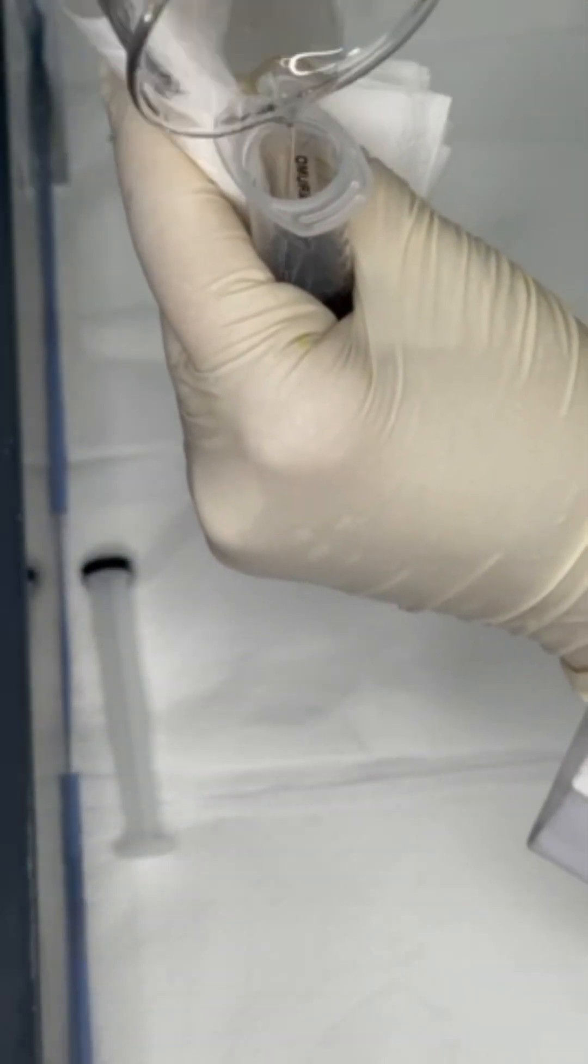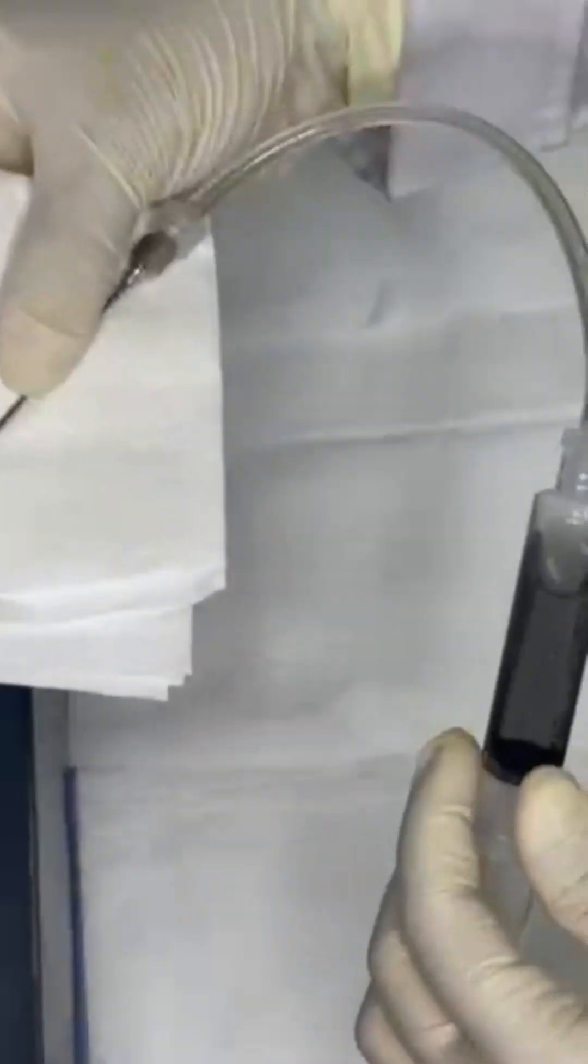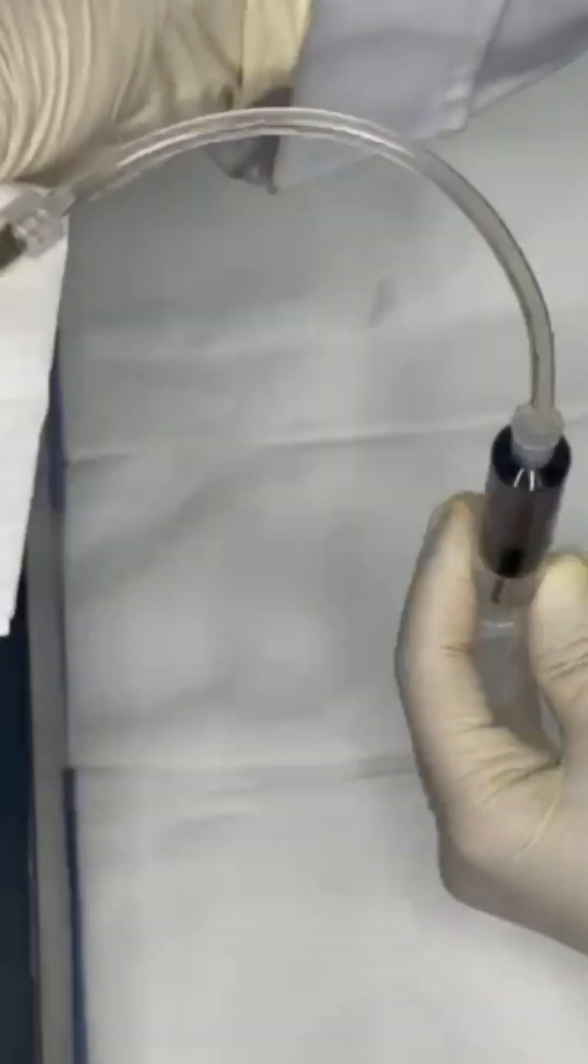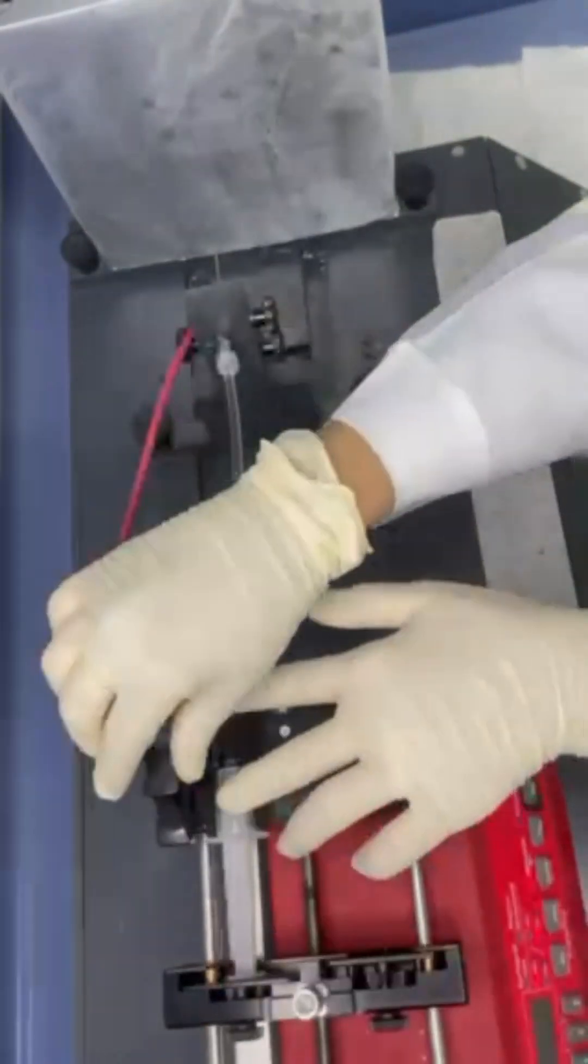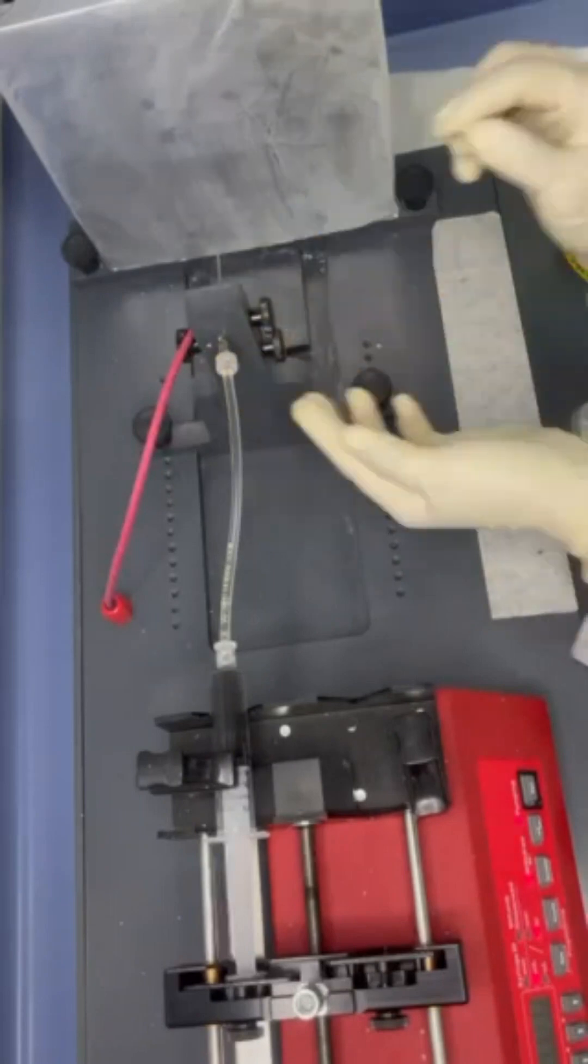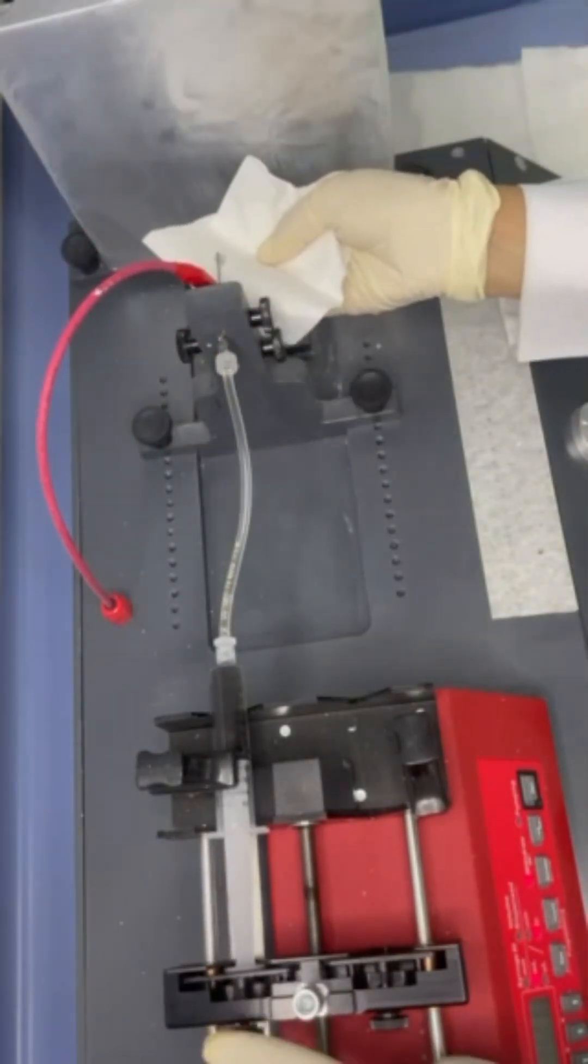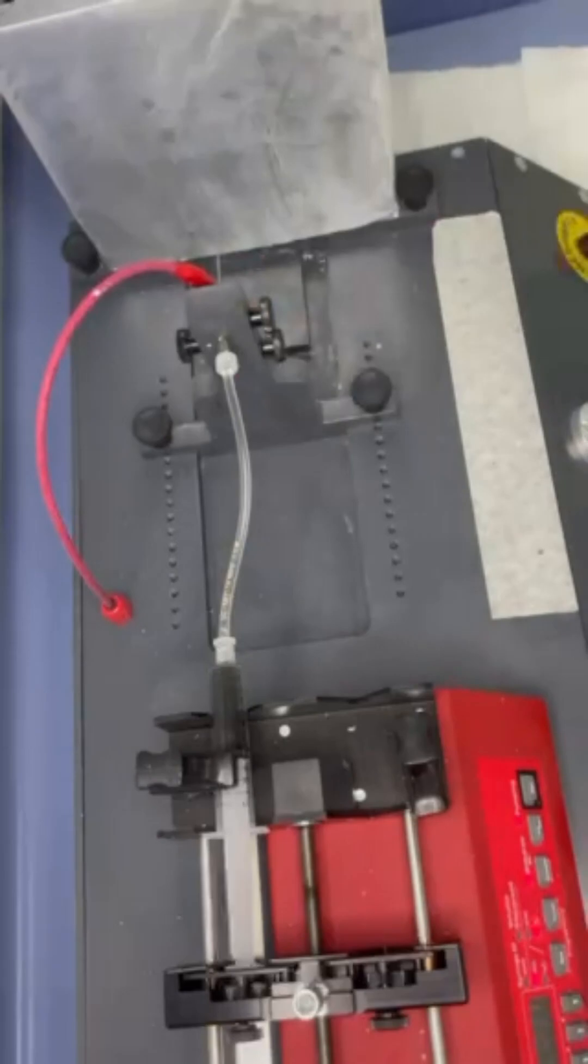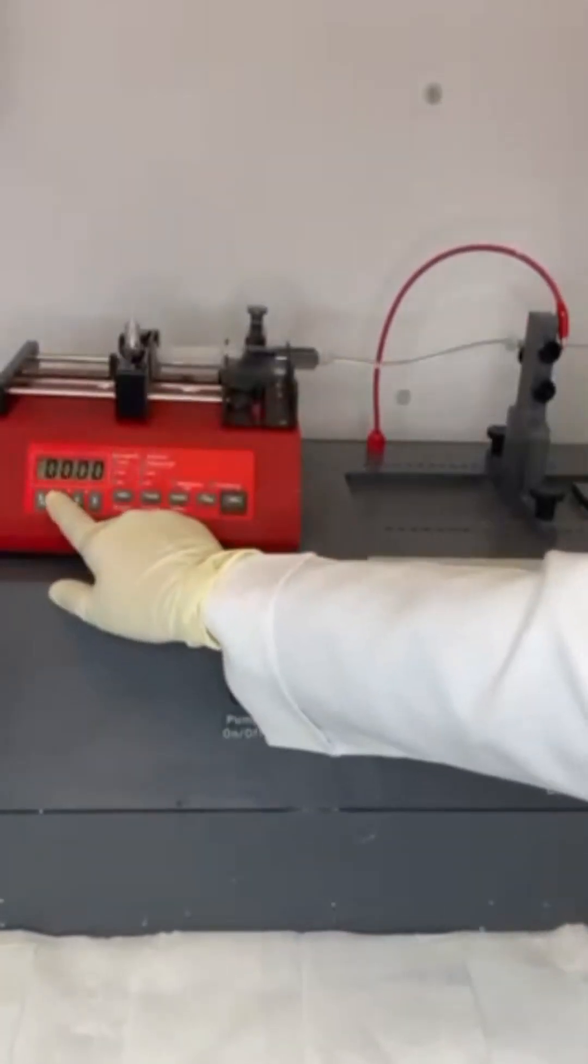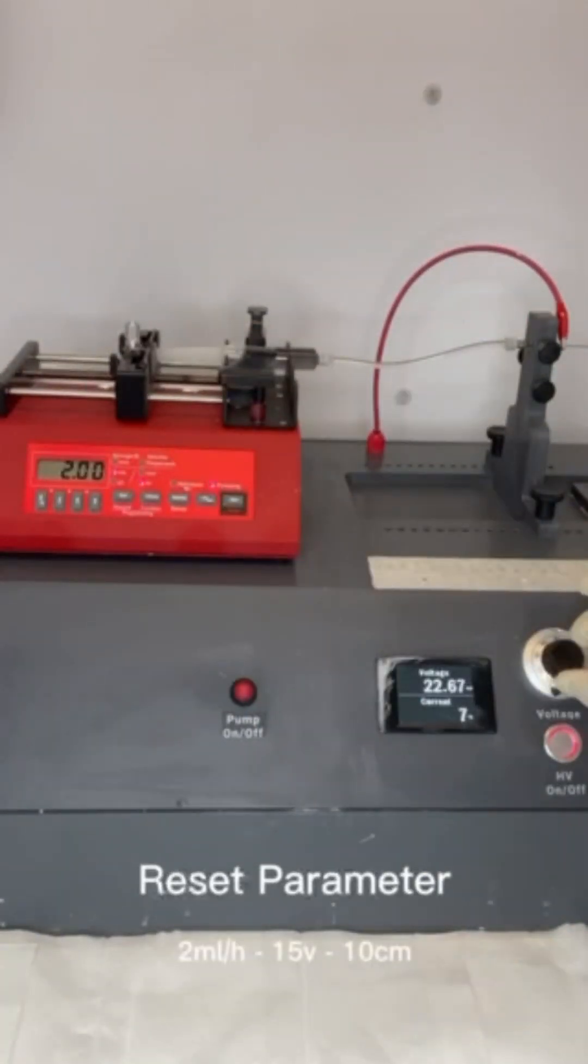Fill the needle with the mixture and make sure there are no bubbles. Put the needle and check the parameter.